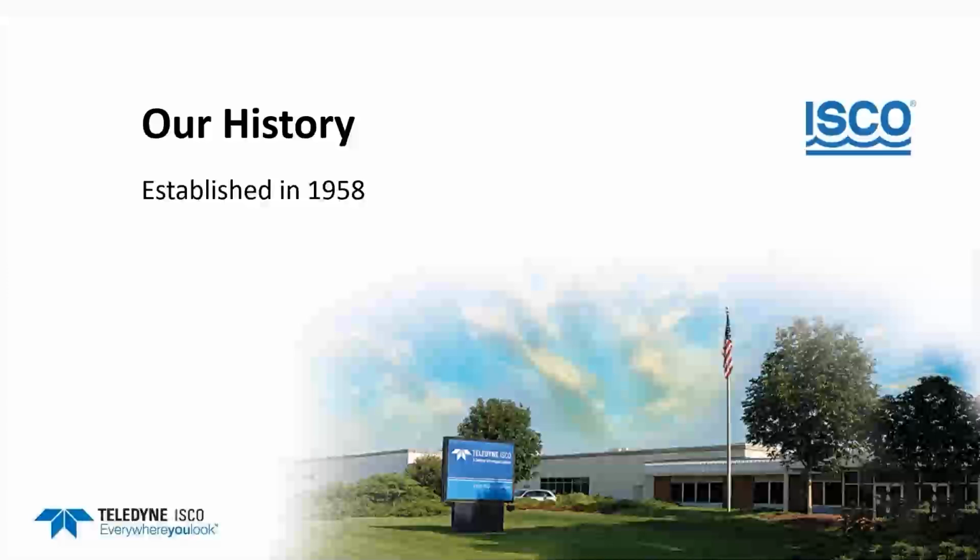I will say that SENTRY provides a great product to detect real-time organic overloading or toxic shock, information on a real-time basis, which is an excellent thing. Now let's discuss how to capture representative samples during such events.